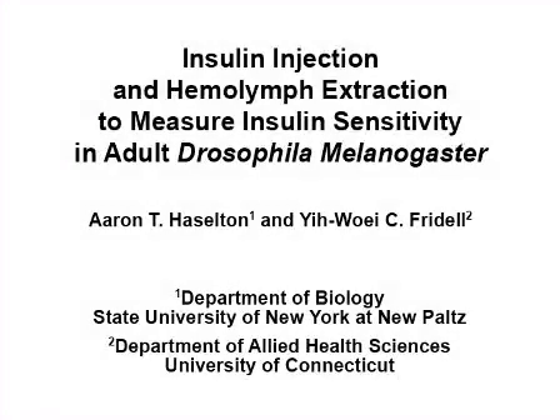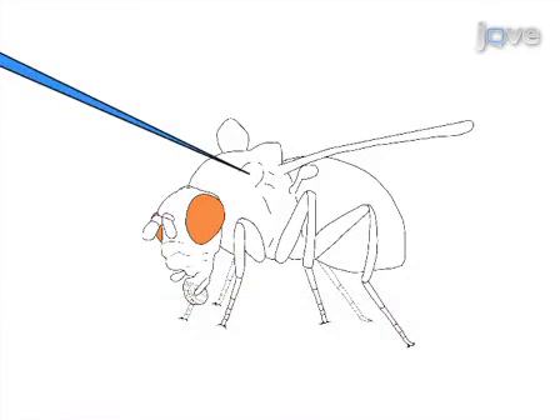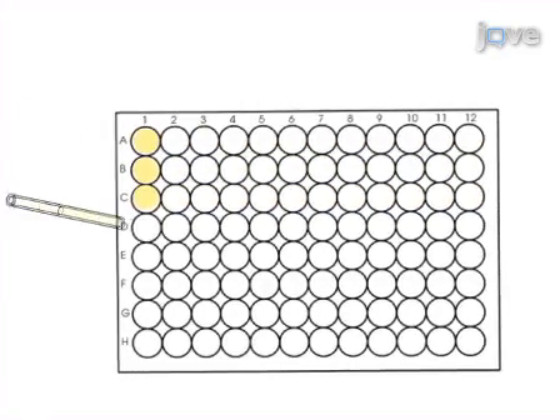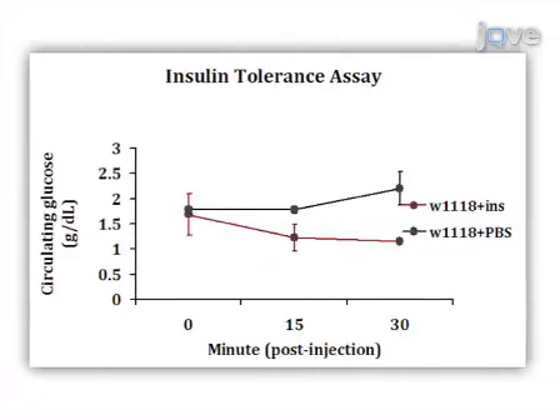The overall goal of this procedure is to measure the effects of injected insulin on hemolymph glucose levels in adult Drosophila melanogaster. This is accomplished by first allowing starved flies to ingest a concentrated glucose solution, then injecting glucose-fed flies with insulin, collecting an uncontaminated hemolymph sample, and finally determining the hemolymph glucose concentration. Results can be obtained showing that exogenous insulin facilitates glucose clearance in Drosophila melanogaster through spectrophotometry.